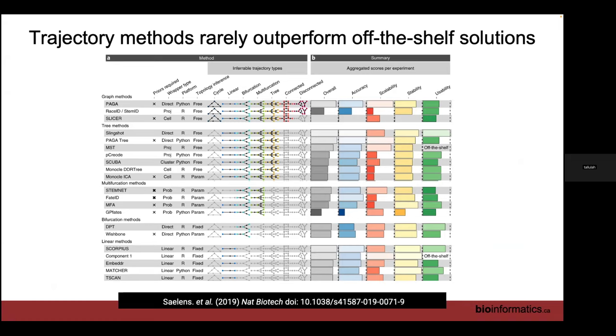Yeah, so it's very common to validate your developmental trajectory by looking at multiple time points and where they're located along that trajectory. Right? If you have 3 different time points, hopefully the average of your 3rd time point is later in your trajectory than your 1st time point. But depending on the data set and actually the method used, you might get quite a big smear at each time point. That's very common to see.